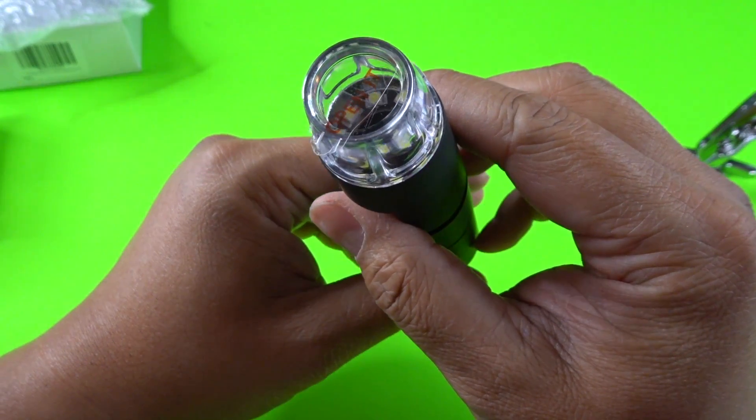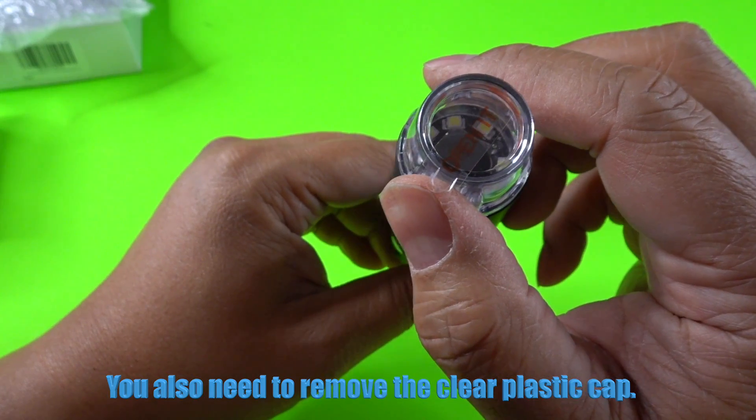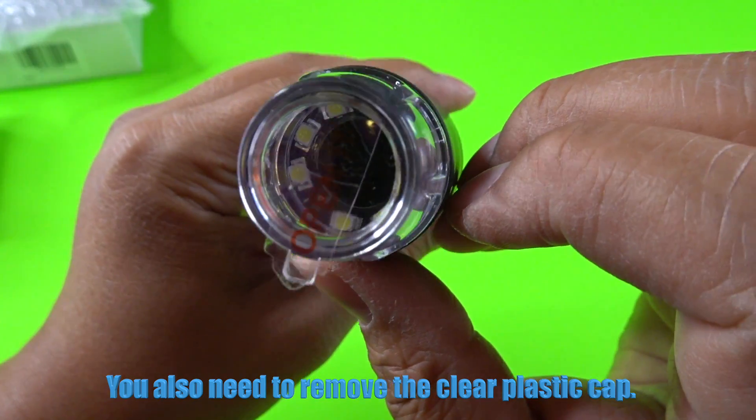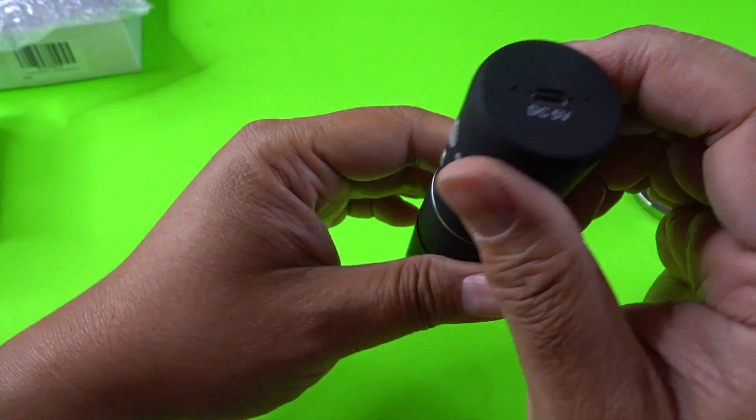Up front is the camera itself. You can see there is a piece of tape here that you need to remove. But there's some LED lights on the inside. If you take a look all around it. There's eight LED lights. And here is a charging input.